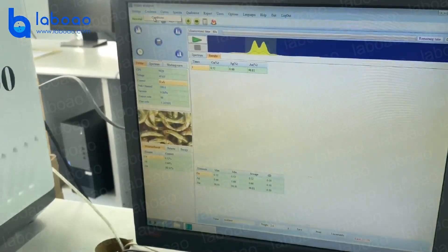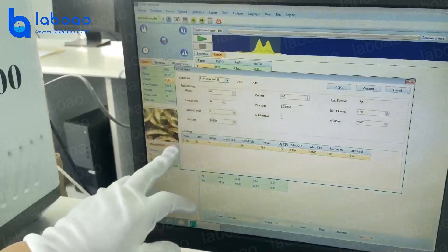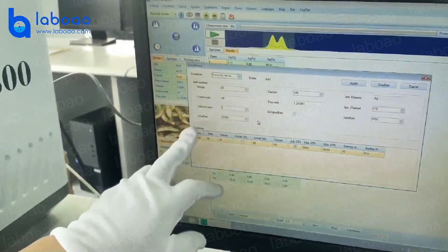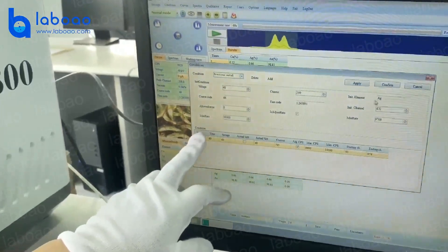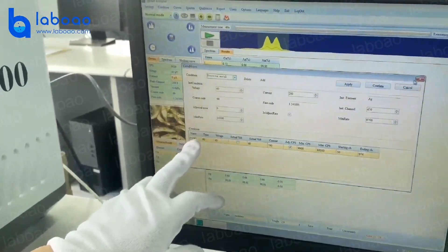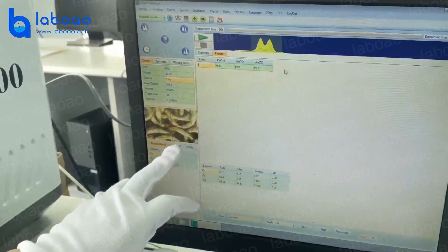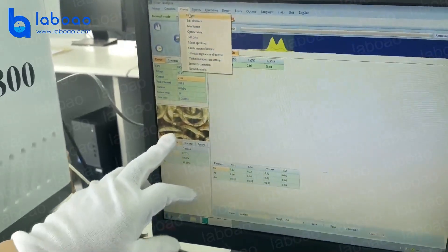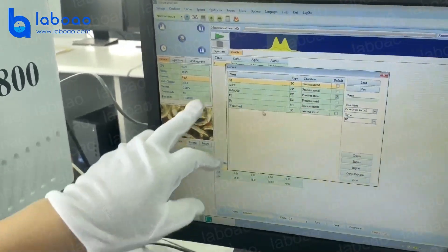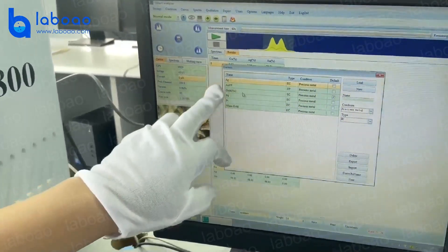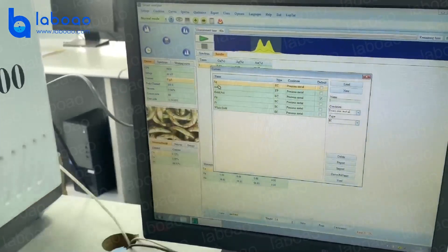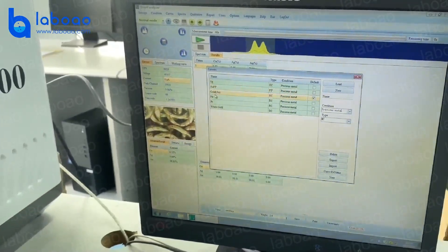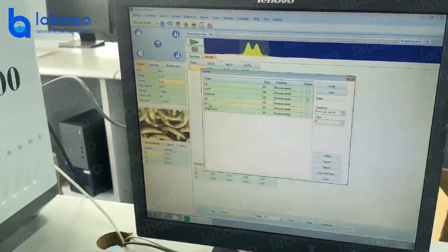This is the testing condition. Before delivery, we already set it. Here are the curves we calibrated — you can see they cover all and go through it.